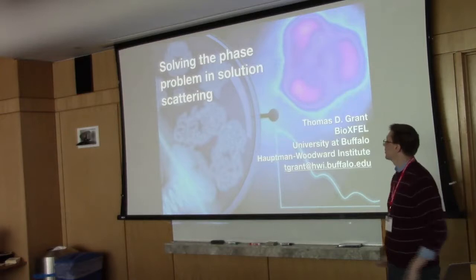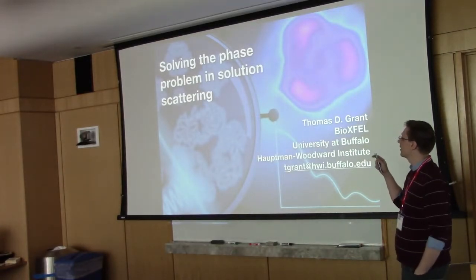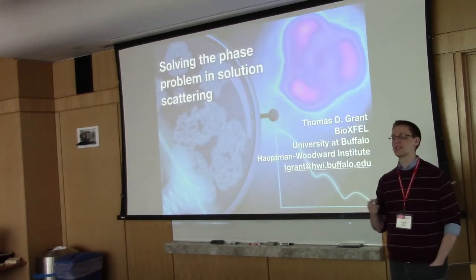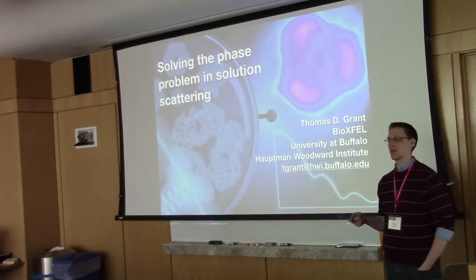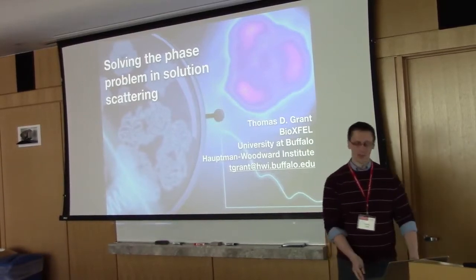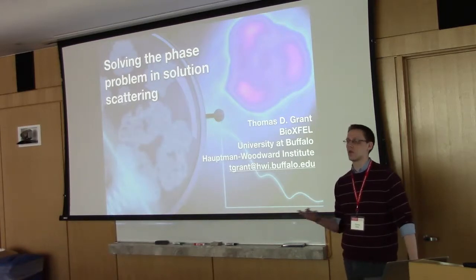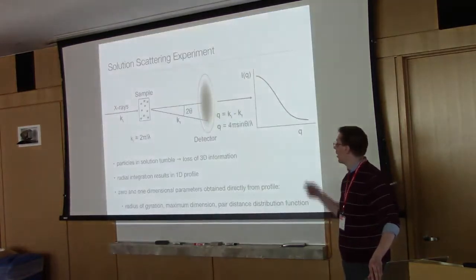All right, so as it was alluded to earlier, I'm going to talk about a method I came up with to calculate the electron density function from solution scattering, which effectively means that this is solving the phase problem for solution scattering. If you're familiar with crystallography, a big part of why it has been successful over the last several decades is that people have figured out ways to solve the phase problem. So here I've done that for solution scattering.